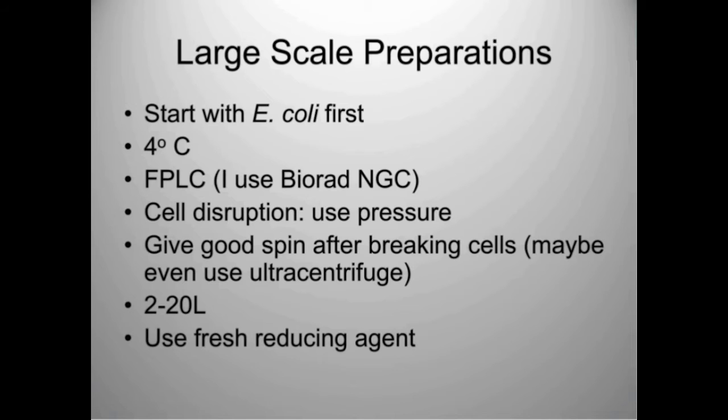Use fresh reducing agents. Reducing agents like DTT and beta-mercaptoethanol go bad quickly—anecdotally about three days at room temperature. If your protein has cysteines, you probably need a reducing agent, and you should keep it fresh at each step as you dialyze or prepare your buffers.